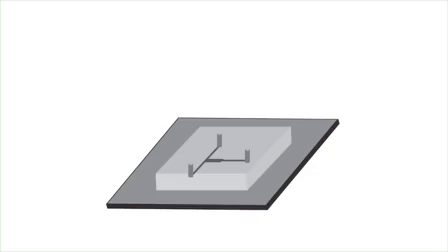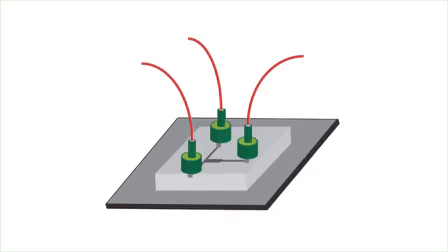The first step of the procedure is to assemble the device, which involves fabrication of the microfluidic chip using soft lithography, punching holes at the inlets and outlets, bonding to a glass slide, and connecting tubing for flow inlet and outlet.